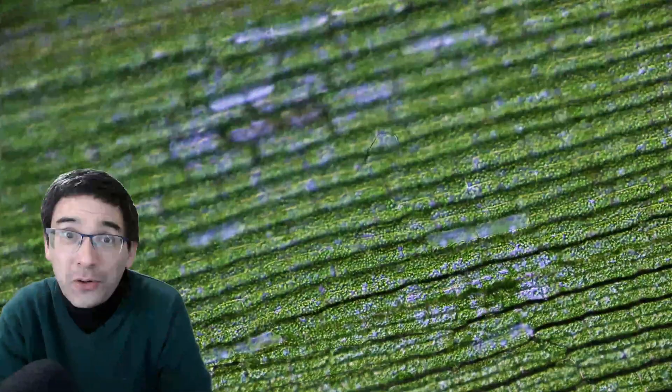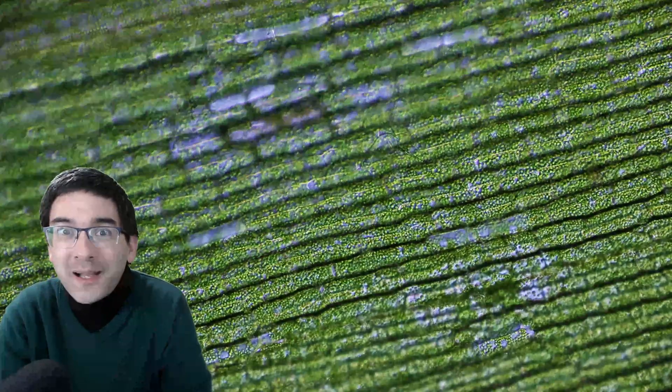These are cell organelles that do photosynthesis, and they are green. Plants are green because the chloroplasts are green. Inside the chloroplasts, there is a green pigment called chlorophyll. Under time-lapse, you can see that those chloroplasts move around quite a bit inside the cell.